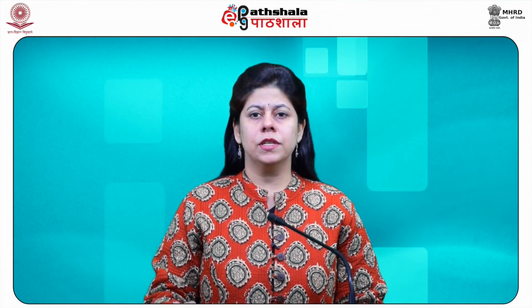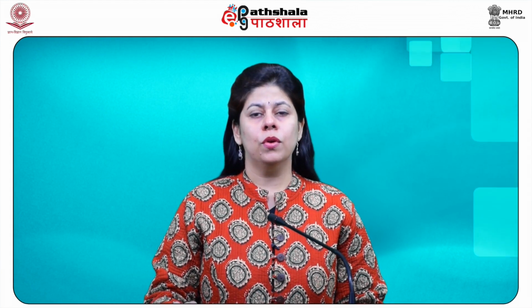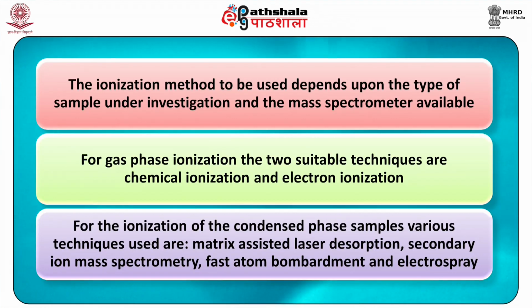Other techniques known as hard ionization techniques are very active and cause ions to undergo extensive fragmentation. The ionization method to be used depends upon the type of sample under investigation and the mass spectrometer available. For gas phase ionization, the two suitable techniques are chemical ionization and electron ionization.